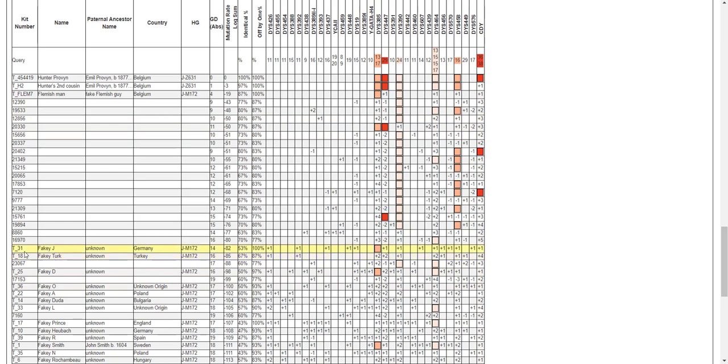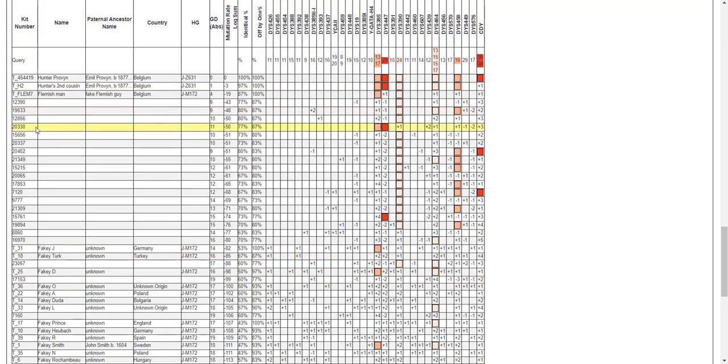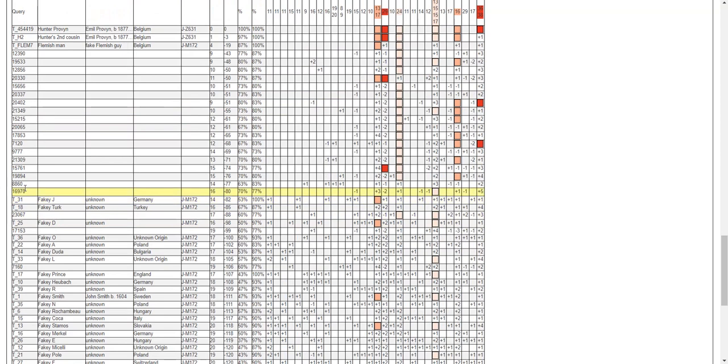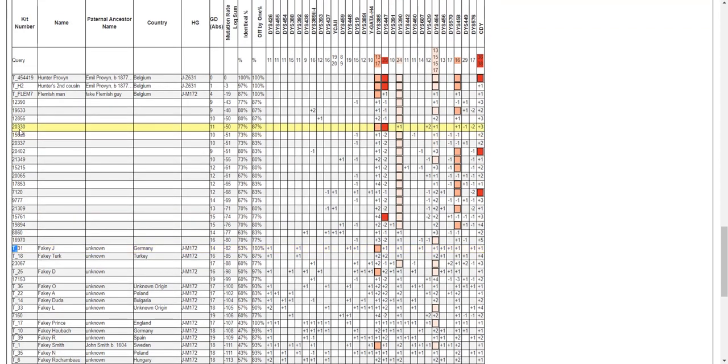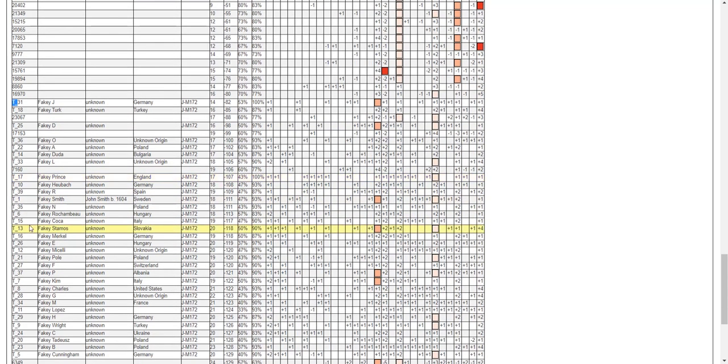So you can see that I've got matches from public YSeq projects, and then I've got matches that start with the ID starting with a T and an underscore. That's how I'm representing the matches from tabular data sources that were externally added. Oh yeah, and let's look at, I made one guy called fakie Thaddeus.